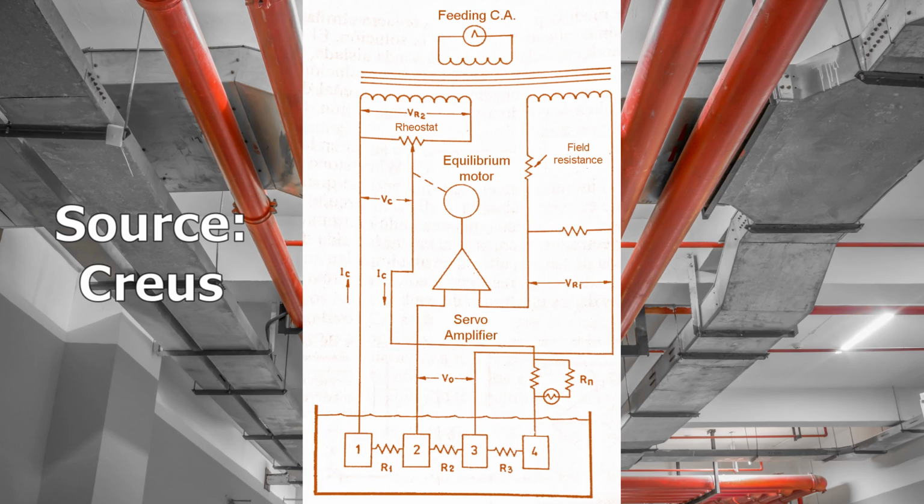Consequently, if the circuit maintains a constant potential difference V0 between two electrodes, regardless of the accumulation of solid deposits, the measurement will be proportional to IC, with the proportionality constant equal to the inverse of V0. V0 is compared with the reference voltage VR, and if there is a difference, it is cancelled through a self-balancing potentiometric circuit, indicating the value of IC at all times.